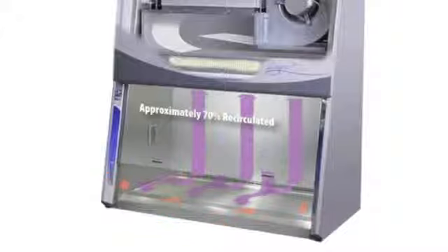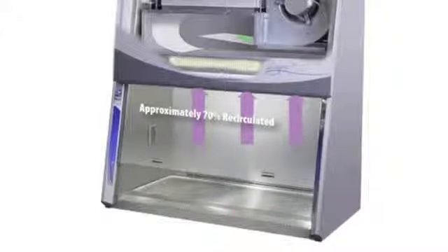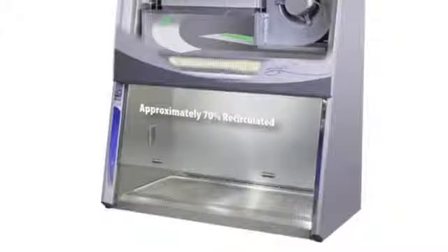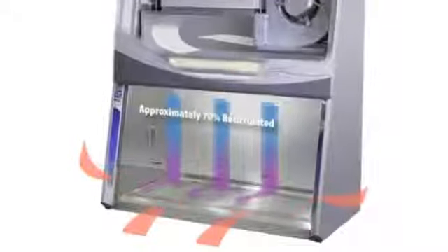This contaminated air is drawn by the blower through the back plenum of the cabinet where approximately 70% of the air is recirculated through the supply HEPA filter and back over the work area.